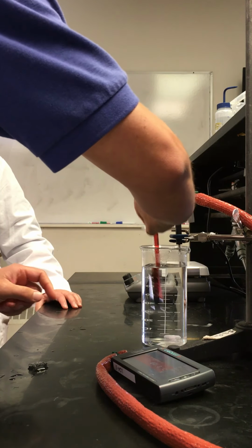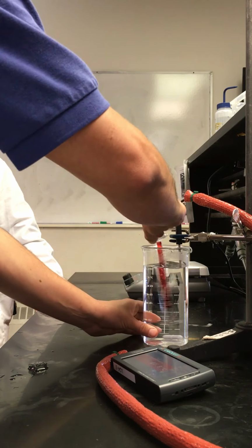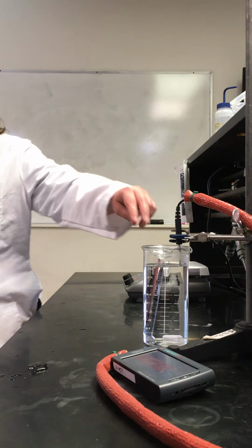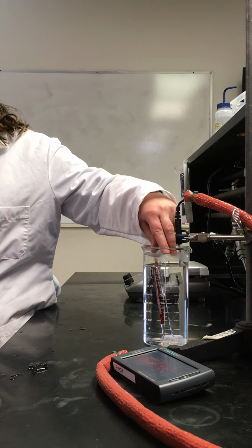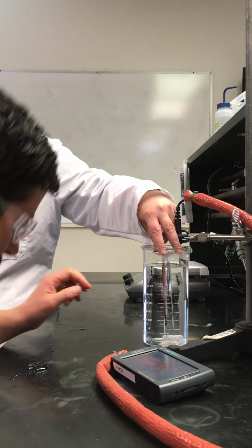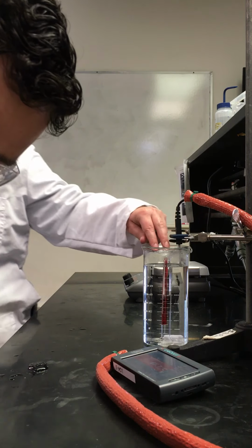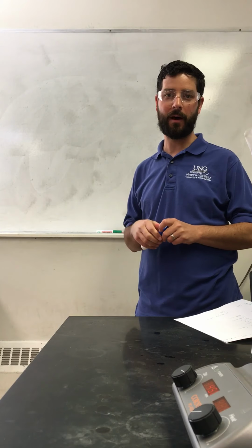Sounds like a dinner bell. So 60.7 and 6.9. Last thing we need to do here is talk about what to do with our data.